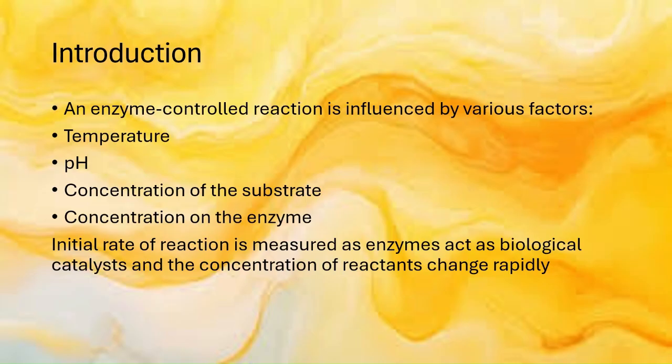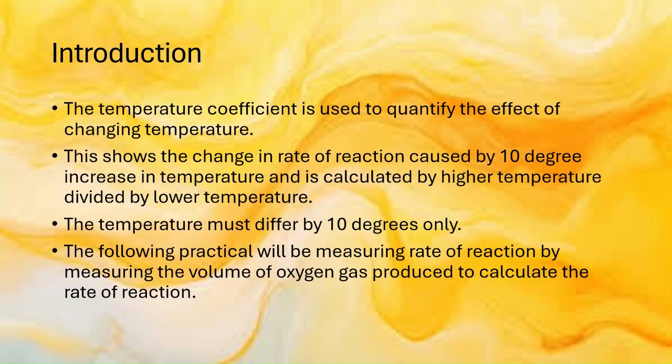So the initial rate of reaction is measured as enzymes act as biological catalysts and the concentration of reactants change rapidly. The temperature coefficient is used to quantify the effect of changing temperature.